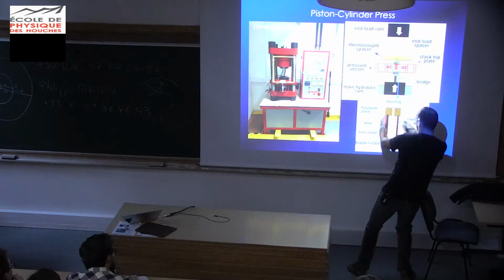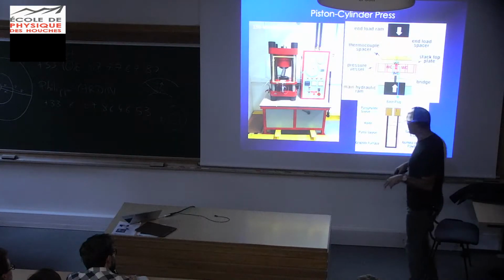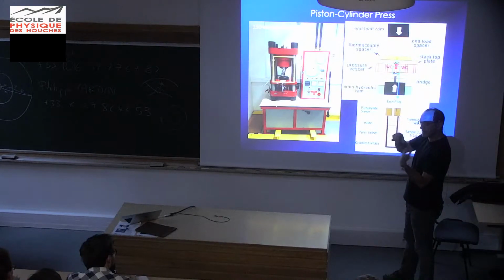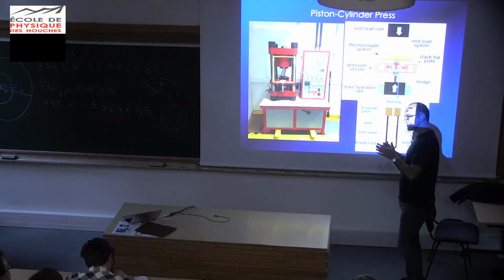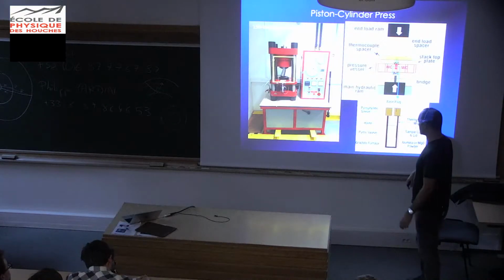It's this thing called halite, which is a very smart and sophisticated word to say salt. So you put salt around your sample, and that acts as a lubricant. And actually you have to calibrate it depending on what you're using. So we have one calibration for salt, we have a calibration for talc. You use different things depending on what you want to achieve. Talc is slightly better insulating, and salt is a little more fluent, so it fluxes more, so it gets you to higher pressure.